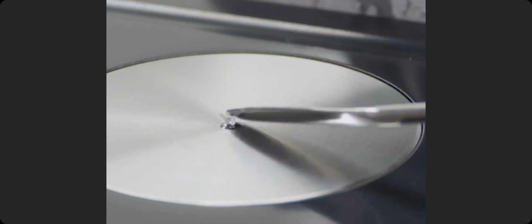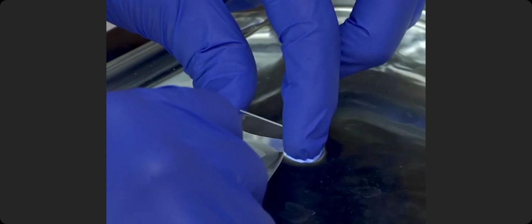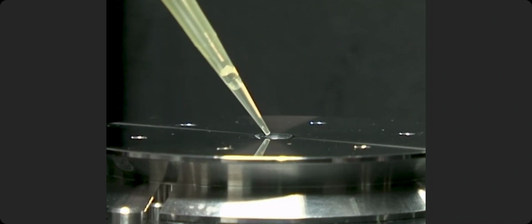This video will illustrate the characterization of an unknown organic compound with IR spectroscopy and will introduce a few other applications of IR spectroscopy in organic chemistry.